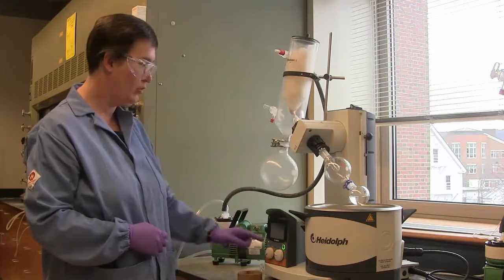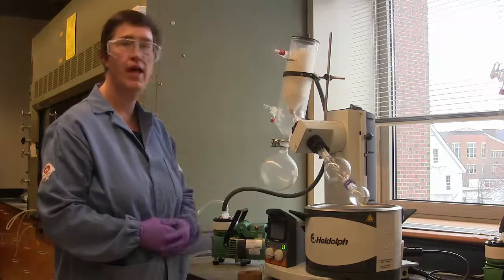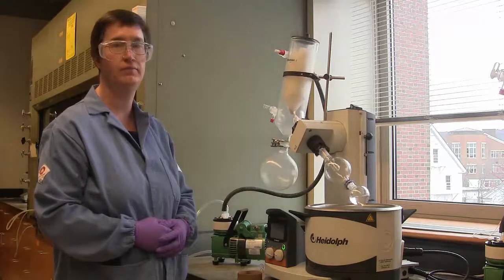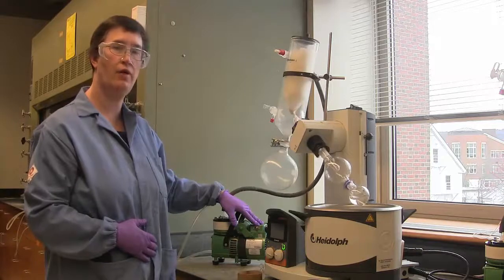To get started, I'm going to adjust the spin knob so that my flask is rotating in its fastest setting. After that, I will turn on the vacuum pump, which is my source of vacuum for the rotary evaporator.